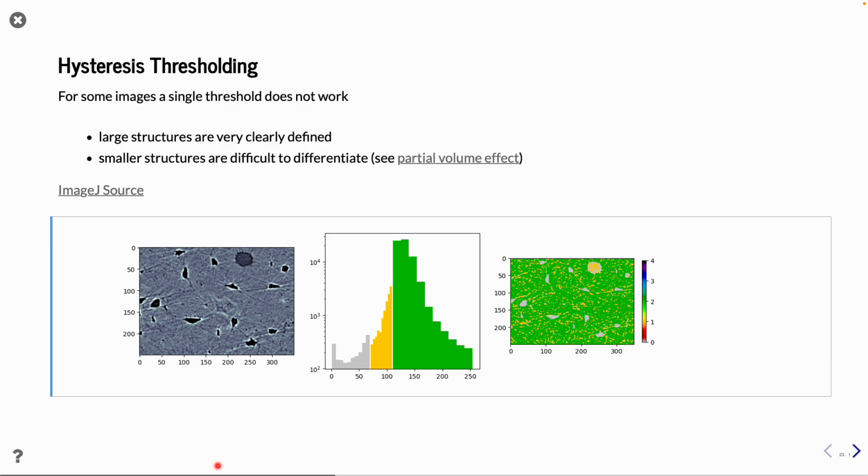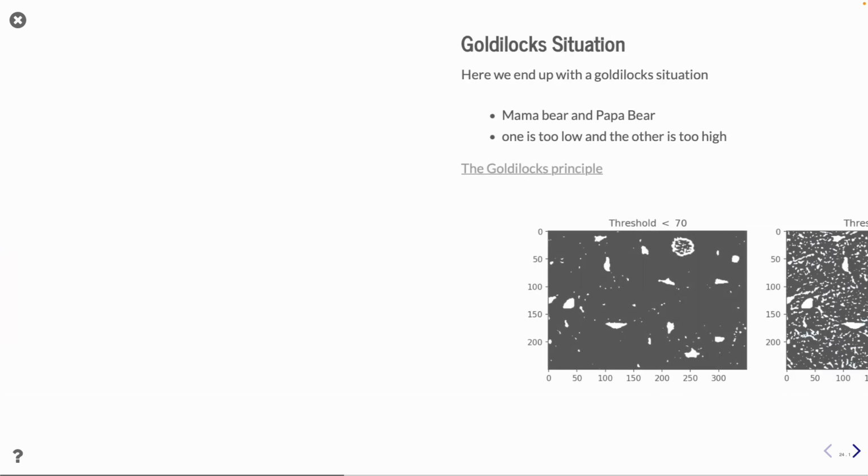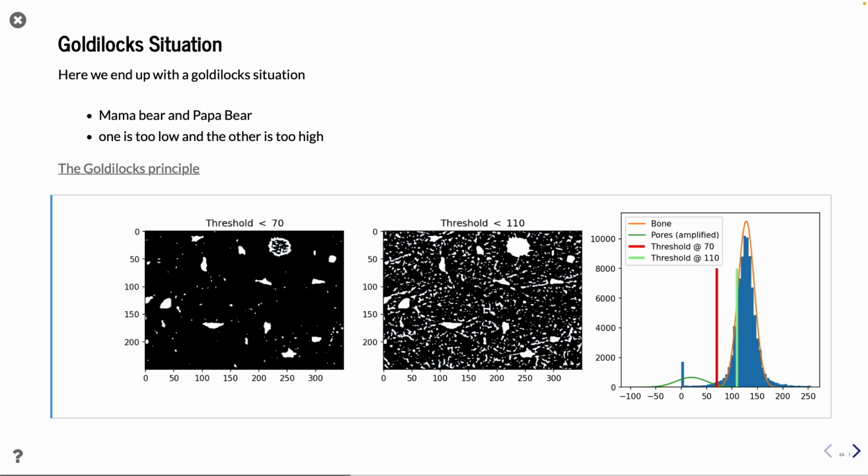And here you can see an example where I put two thresholds. I put one, a strict one, which is very close to the peak, and one less strict. And you can see in the green, I get the full region, but maybe I miss some relevant features. And then when I go to the yellow one, I get a lot of misclassifications, which I don't want to have. So let's see what we can do.